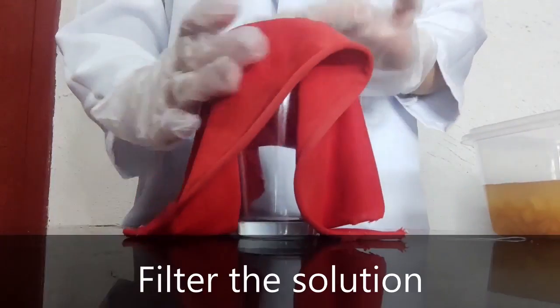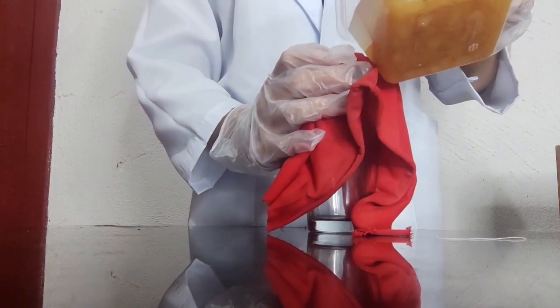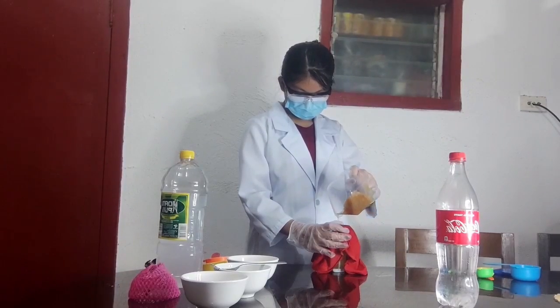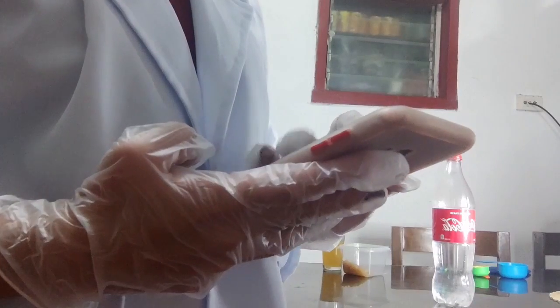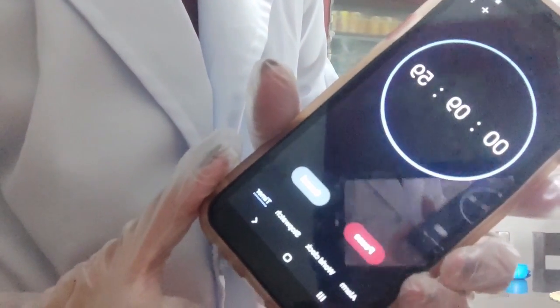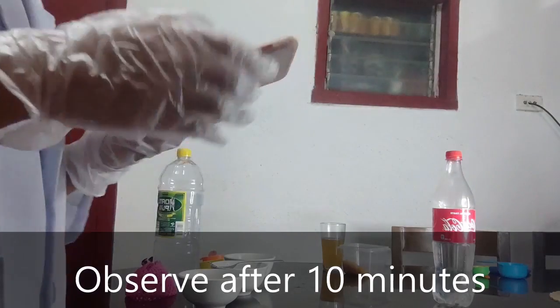Using a cloth filter, filter the solution. Afterwards, wait for 10 minutes.